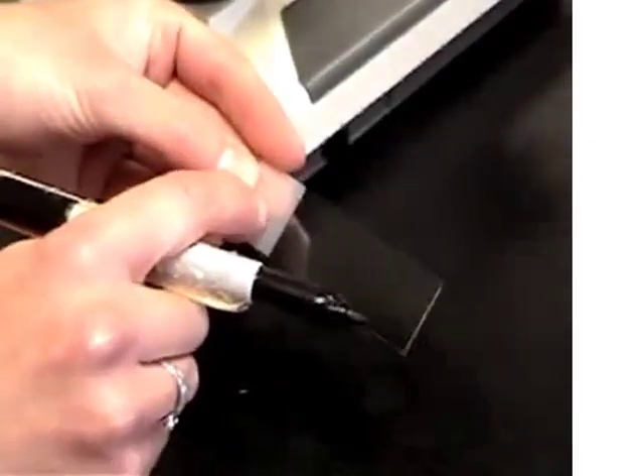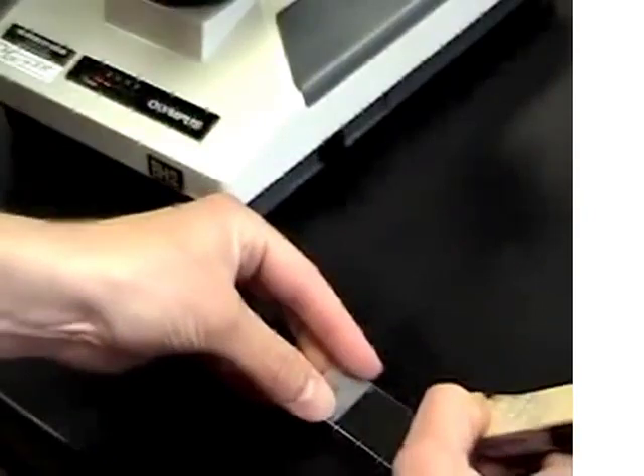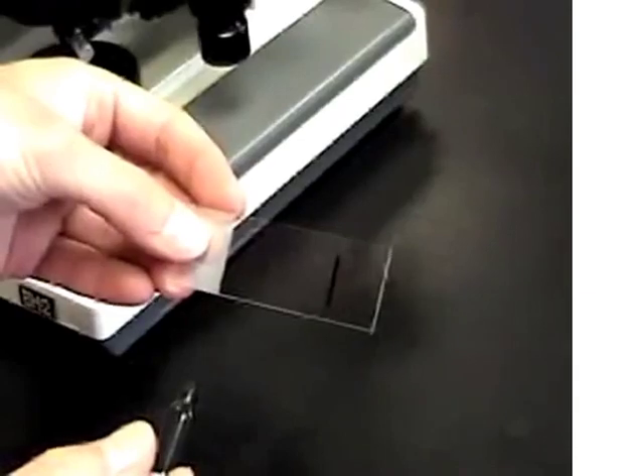Collect a slide from your slide box. Be sure to place it with the frosted side of the slide facing up. Draw a line on the frosted side of the slide — this will be your focus line.